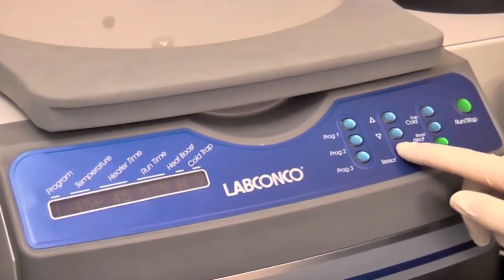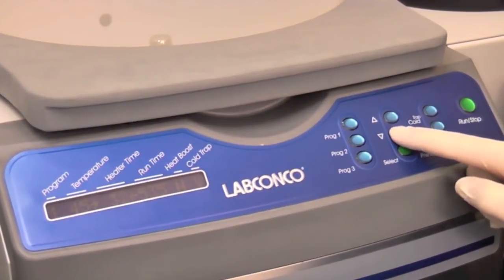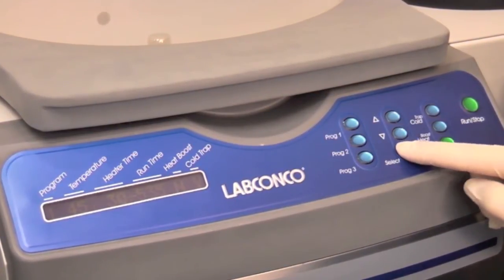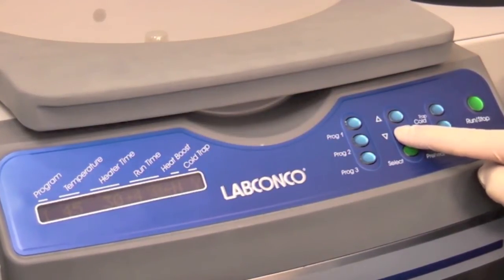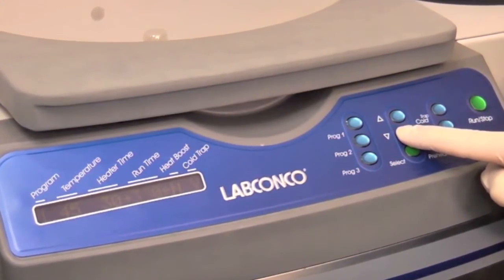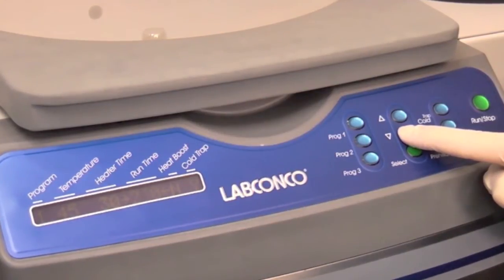When select is pressed again, the arrows move to heater time. For heat sensitive samples, the heater can be turned off before evaporative cooling is complete. Set the heater time for 30 minutes. Set the run time for 60 minutes.